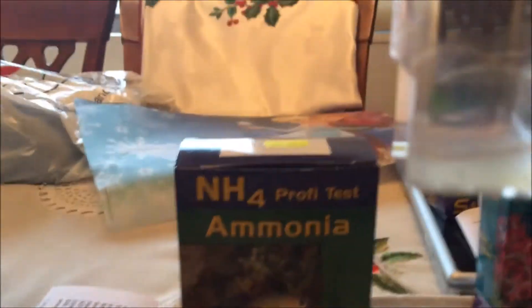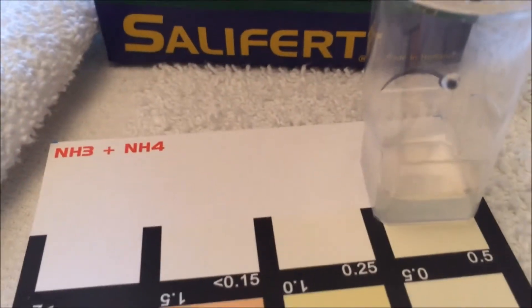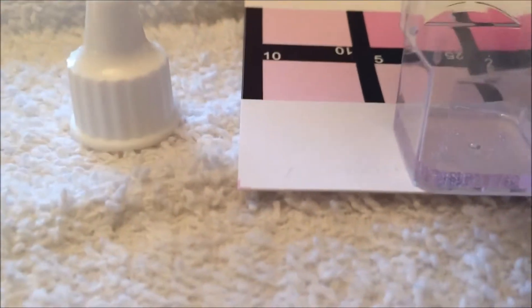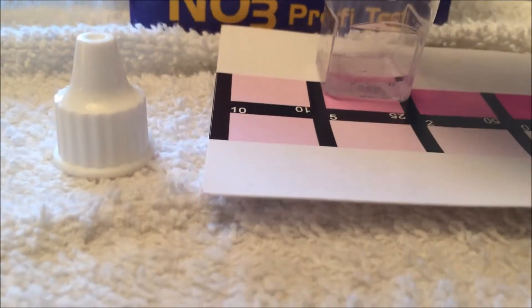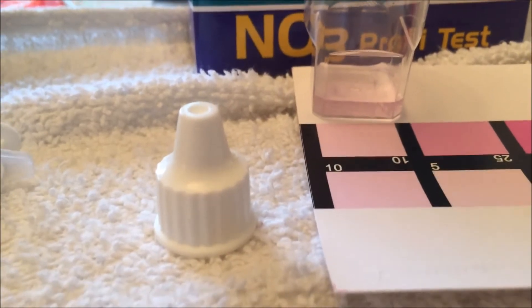Here is the ammonia from Salifert - white, detecting nothing at all. API is at 0.50 and it's beige; Salifert is white. And here are your Salifert nitrates - I don't even need a piece of paper, this is pretty obvious. Look at the color on that - we're looking at about 10, maybe a little more, maybe around 15 ppm nitrates.